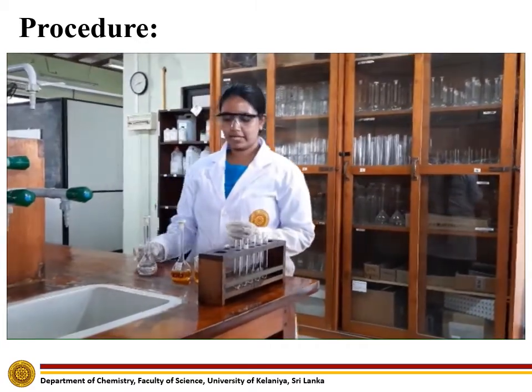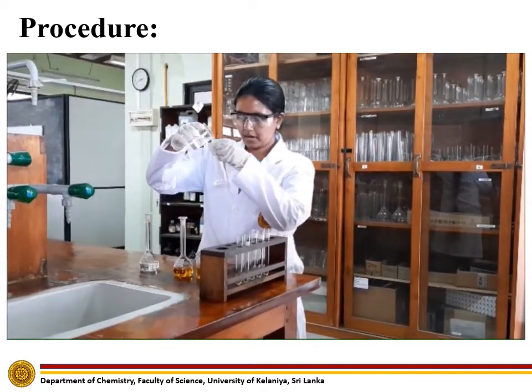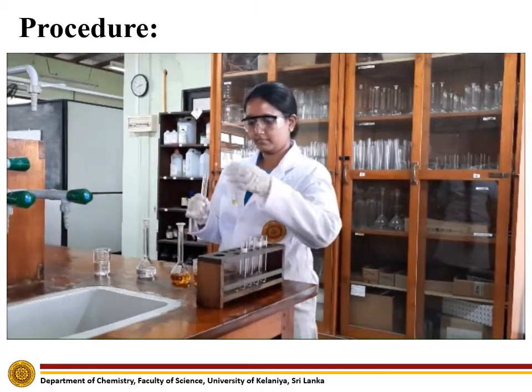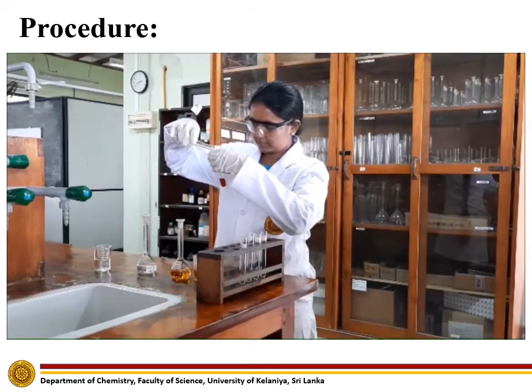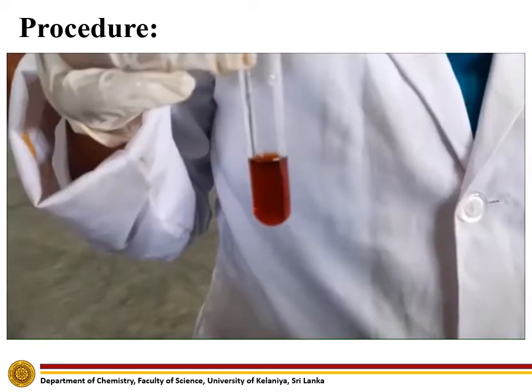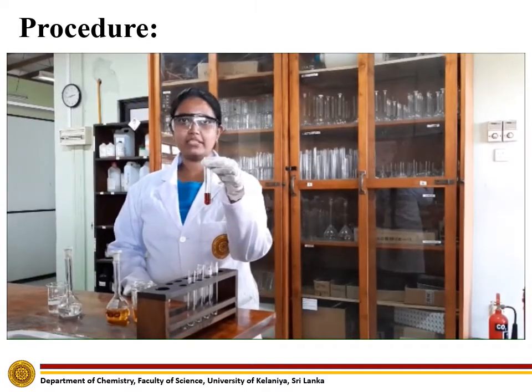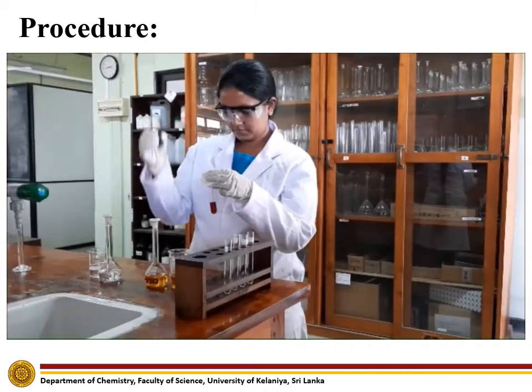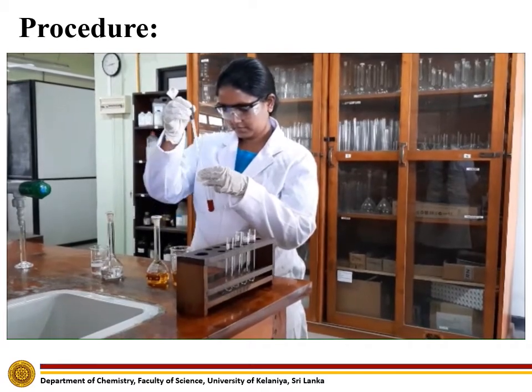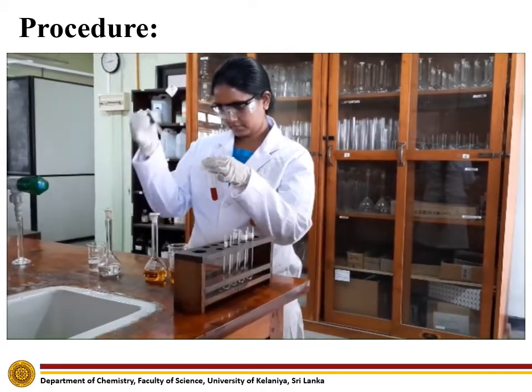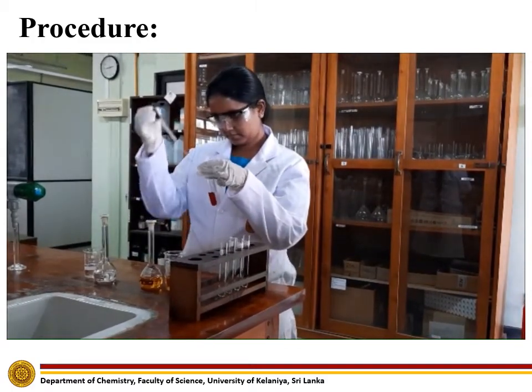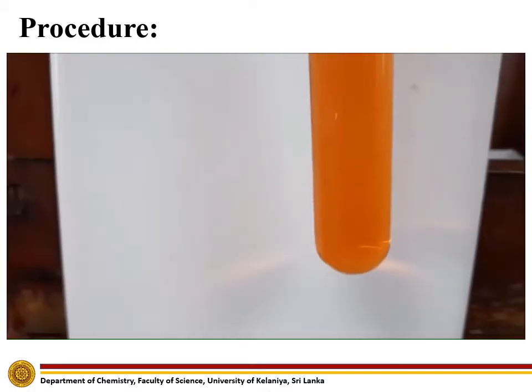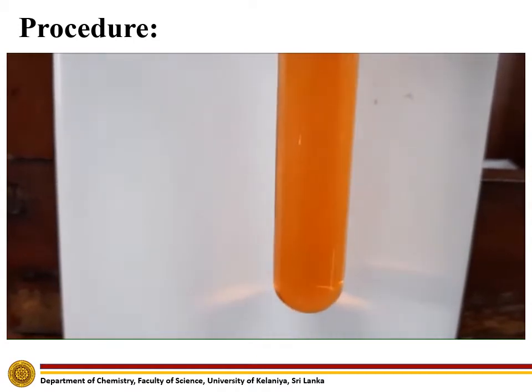Now let's add 2 ml of potassium thiocyanate to the same test tube. Now let's dilute this blood red solution until it becomes a pale orange color using distilled water. This is the pale orange solution we obtained after diluting.